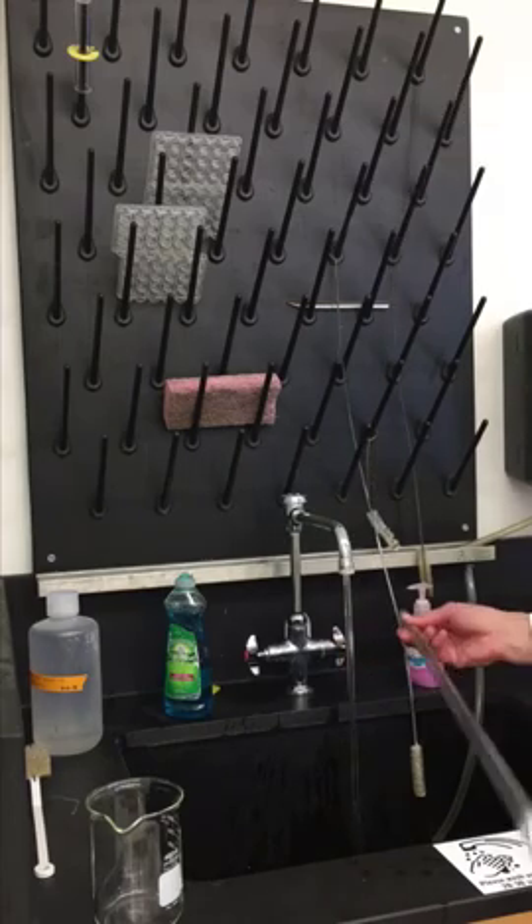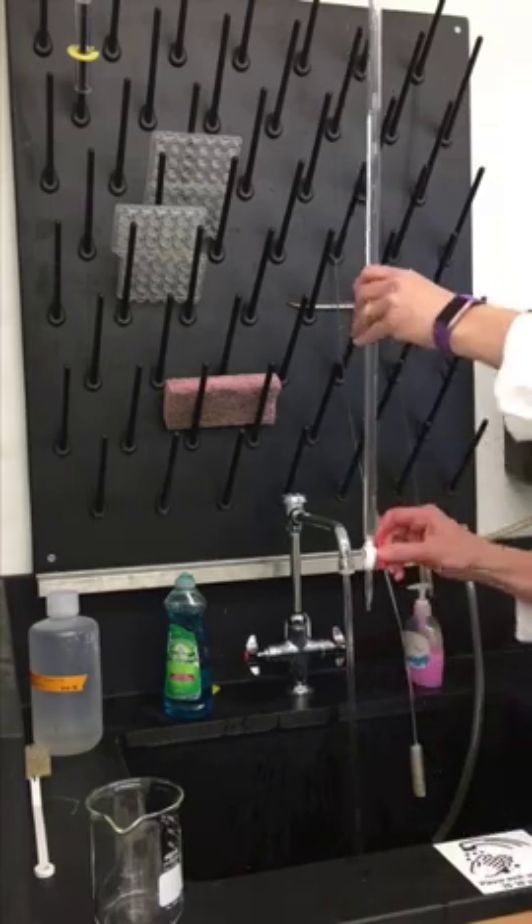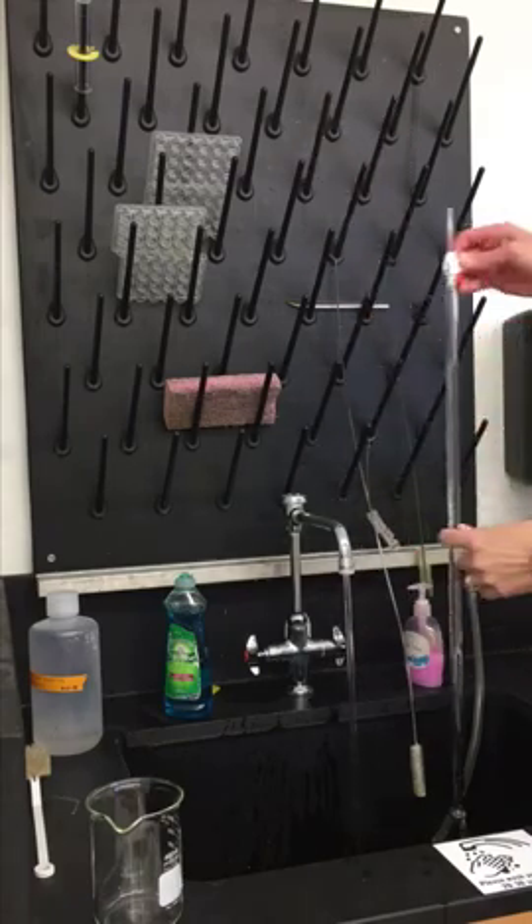I'm going to do one more rinse because I need to make sure I get the soap out of the tip as well. So I'm going to run it through the tip, and then when I'm done I'm going to turn it upside down and let it run out.